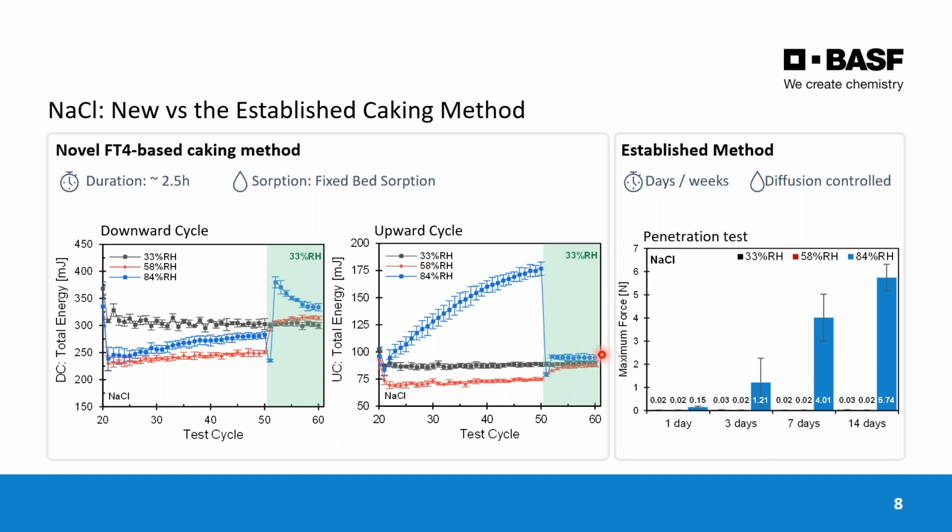In other words, we're able to remove the humidity before substantial solid bridge formation occurs. So we're seeing some deliquescence in here. That's affecting the flow behavior. We probably haven't got solid bridges forming quite yet. We haven't given enough time for that.